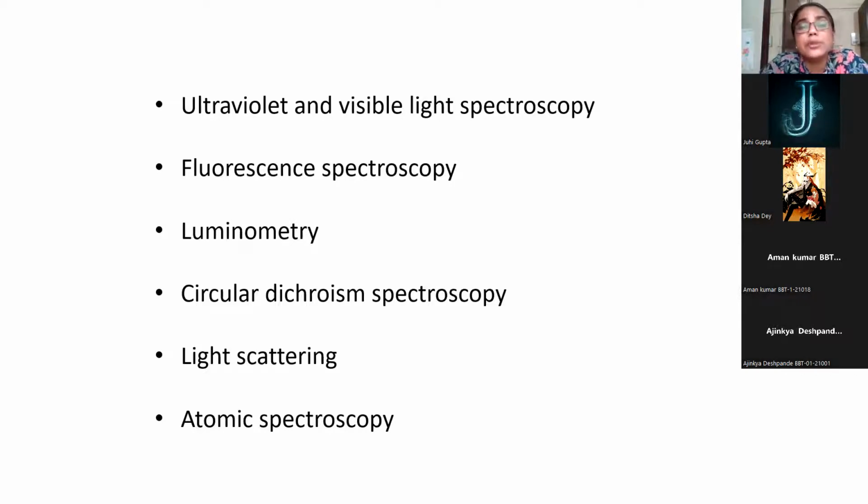We also studied the prism experiments where you saw dispersion of light. So that basic is going to help you to build up on that. Now, when we say light is composed of, it has 3 components. It has ultraviolet radiations, it has visible light, and it has infrared also.